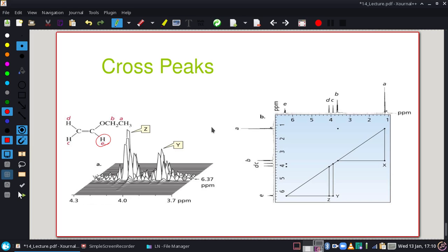Well, COSY, or correlated spectroscopy, actually does a weird thing with the sample, and we actually cause little weird peaks to pop up off axes. That's what this little thing is. It's not actually along the diagonal or on the end. It's just this weird, we call it a cross peak. Well, that cross peak happened because whatever peak A is, it's being split by whatever peak B is. The cross peaks tell us which 2 are splitting each other.